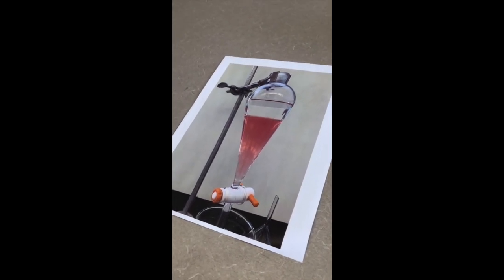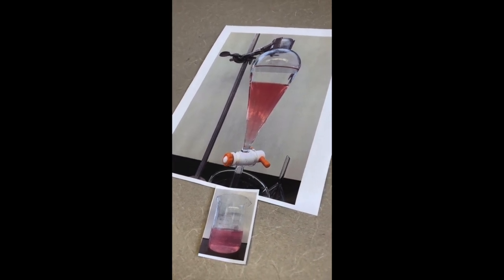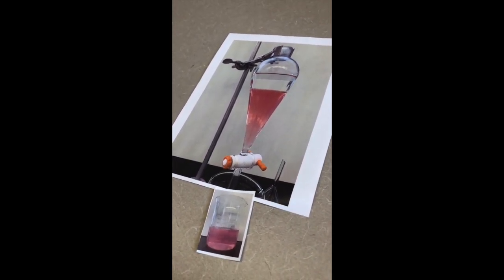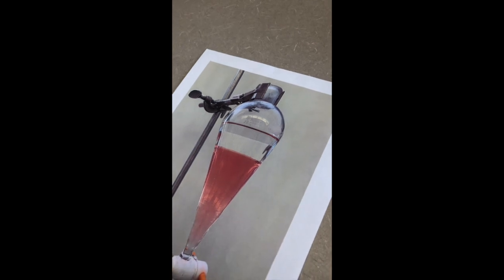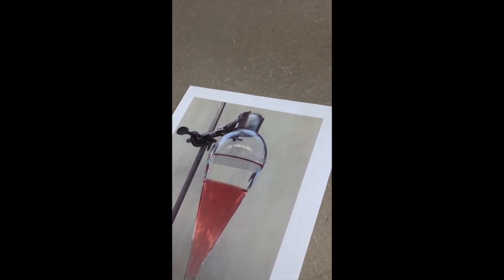So now we are going to drain these into their appropriate layers. So let's start with the bottom one, our water layer. So we drain this, and this is going to contain our conjugate base and water. And then our top layer, our organic layer, is going to contain our base and the neutral compounds.